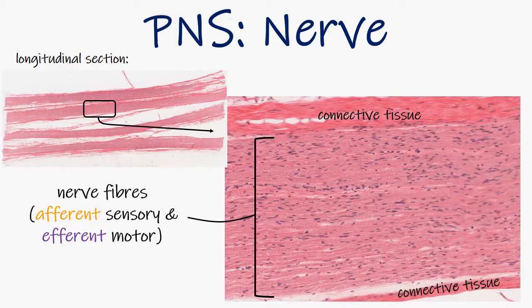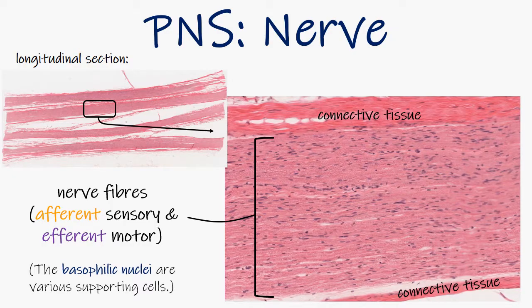There are also a lot of basophilic nuclei, and these are the nuclei of a vast number of cells, including Schwann cells, fibroblasts, and other supporting cells. You would need to use special stains to distinguish these cells.